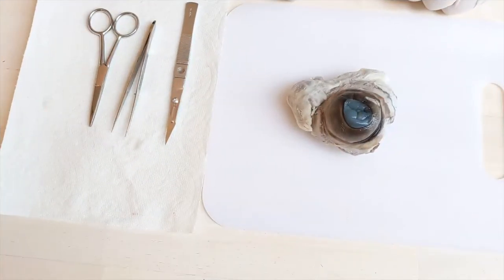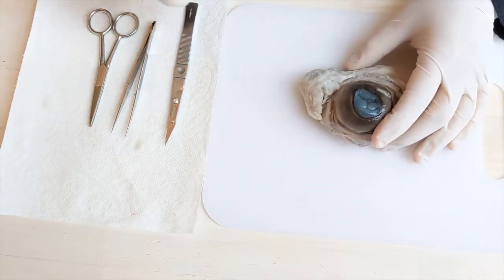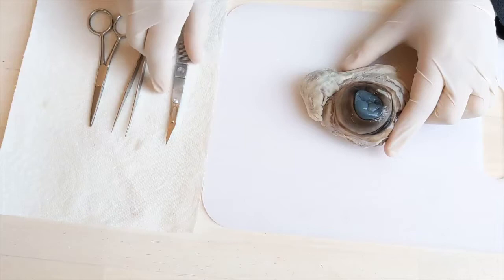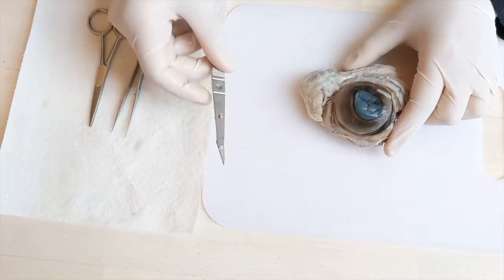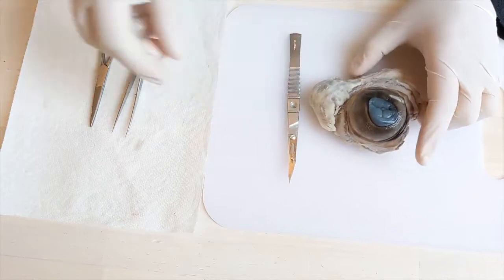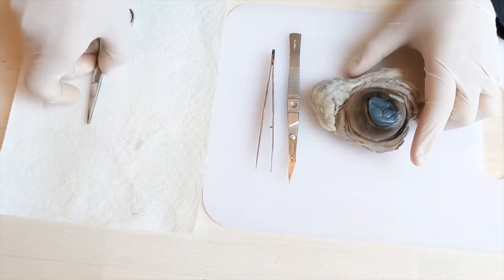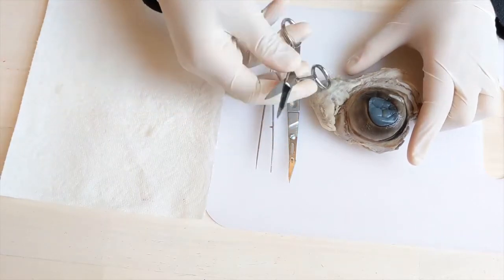Hello everyone, today I'm doing the cow eye dissection. Before I start, I would like to discuss the names of the tools I'll be using today. The first tool I'll be using here is called a scalpel. The second tool I'm using is a forceps and a surgical scissors.